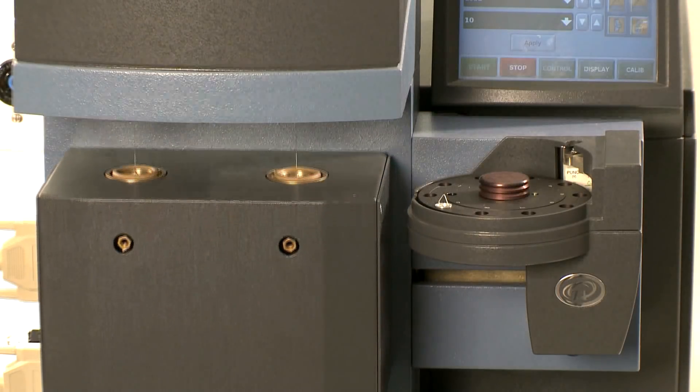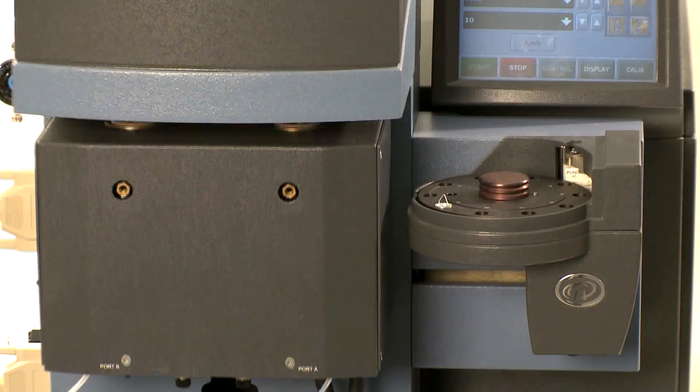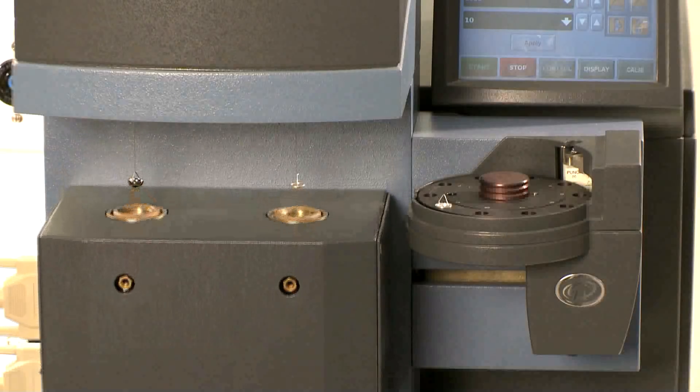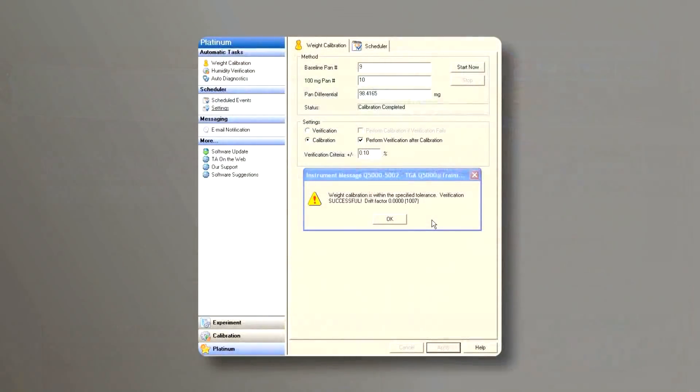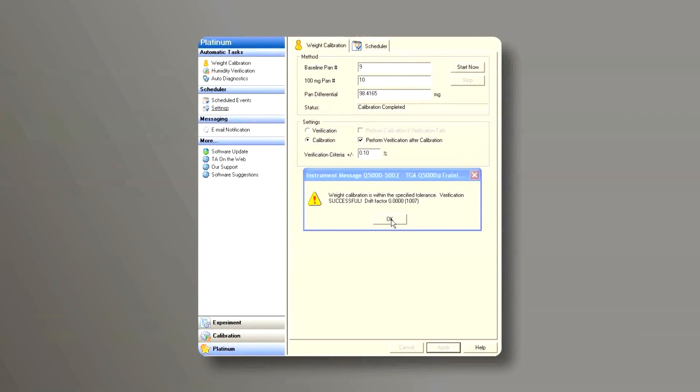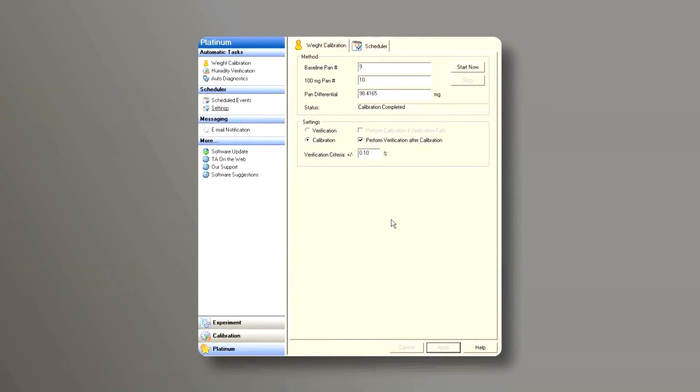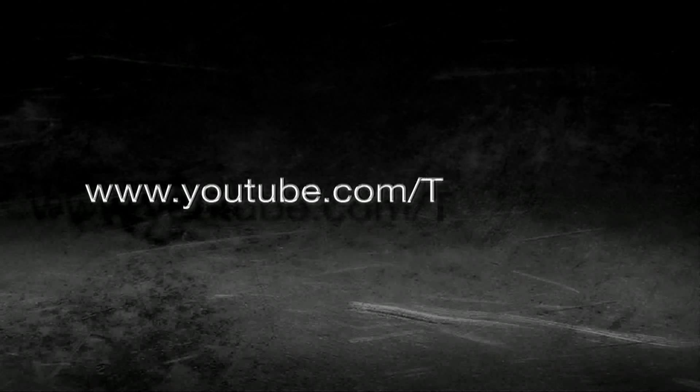After the calibration is done, the instrument sends a message showing weight calibration is within the specified tolerance. Verification is successful. Drift factor is zero. Then we click OK and the calibration is done.